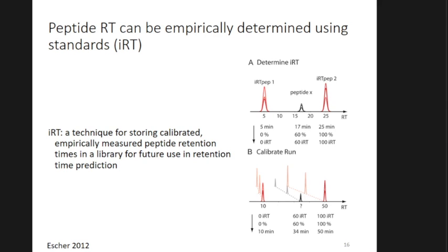SSRCalc won't do anything differently with a modified peptide, but it could change the retention time, right? If anybody has done some phospho work, isoforms of the same phosphopeptide will elute slightly differently, and SSRCalc can struggle with that a little. So especially in things like that, where we're interested in a site-specific modification and really pinpointing the retention time of that, something like iRT is a better solution.